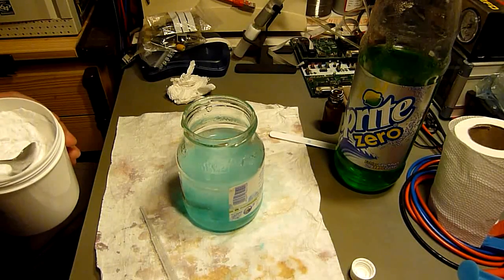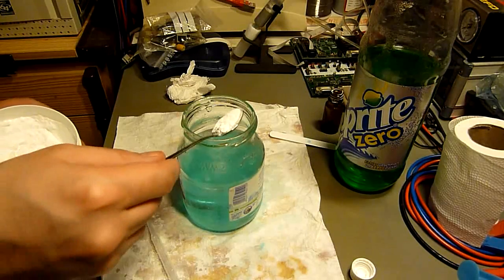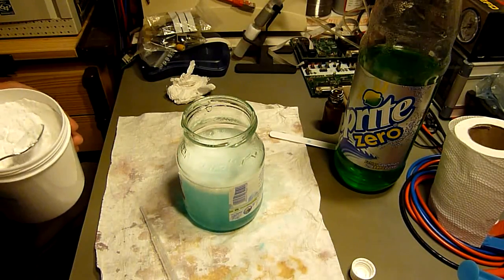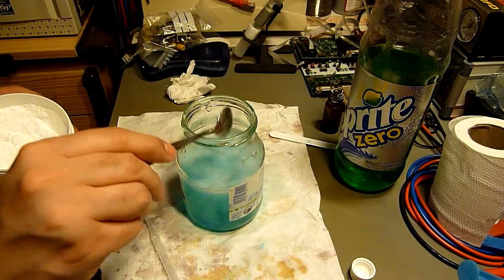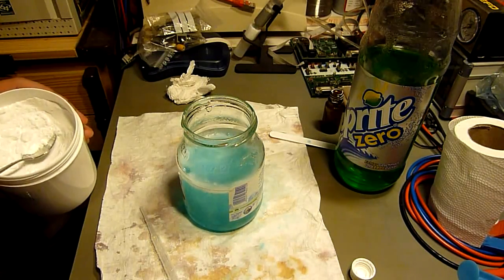Be careful. Although it's not a strong base, it's still a base. And I'm wearing protective glasses, which means if something spreads around here, my eyes will be protected.